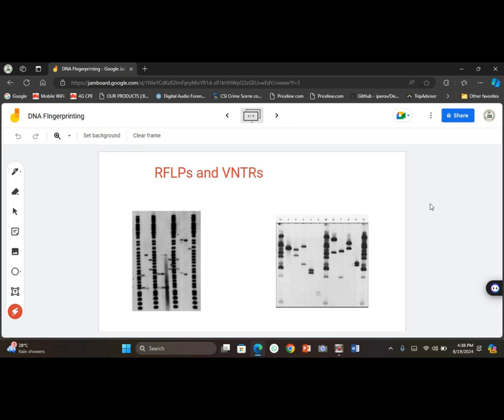This technique is the DNA equivalent of screening sand through a progressively finer mesh screen to determine particle sizes, as if you are using a mesh to screen particles of sand that will make some bigger ones stay behind and the smaller ones go through. So it's just like that. So there's going to be a kind of band pattern.